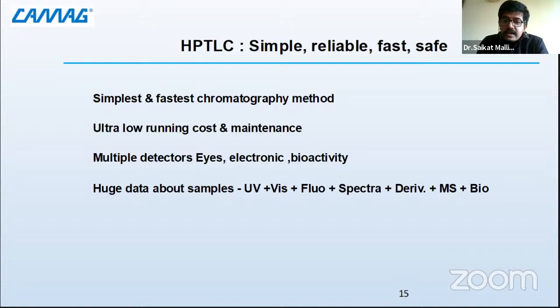So this is an activity which can be directly done like this. You can do many other bioactivities. Definitely, you require a good microbiological lab for this, but you can get a lot of data. So as you see, I'm talking about different aspects of HPTLC. These also correlate with the concept that I want to do a drug discovery in the sense of my plant herb.